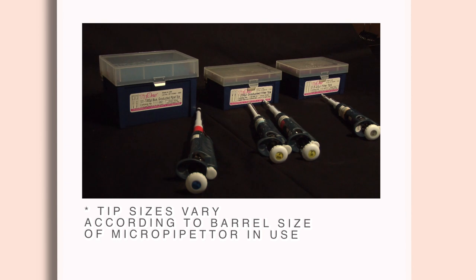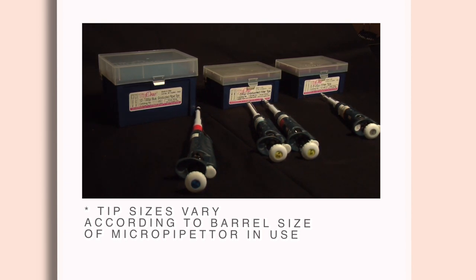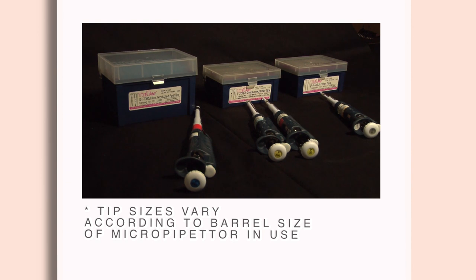Different micropipetters take different sized tips, depending upon the barrel size. P1000s use the largest tips, while the P200 and P20 use an intermediate-sized tip. The P10s use the smallest of tips.